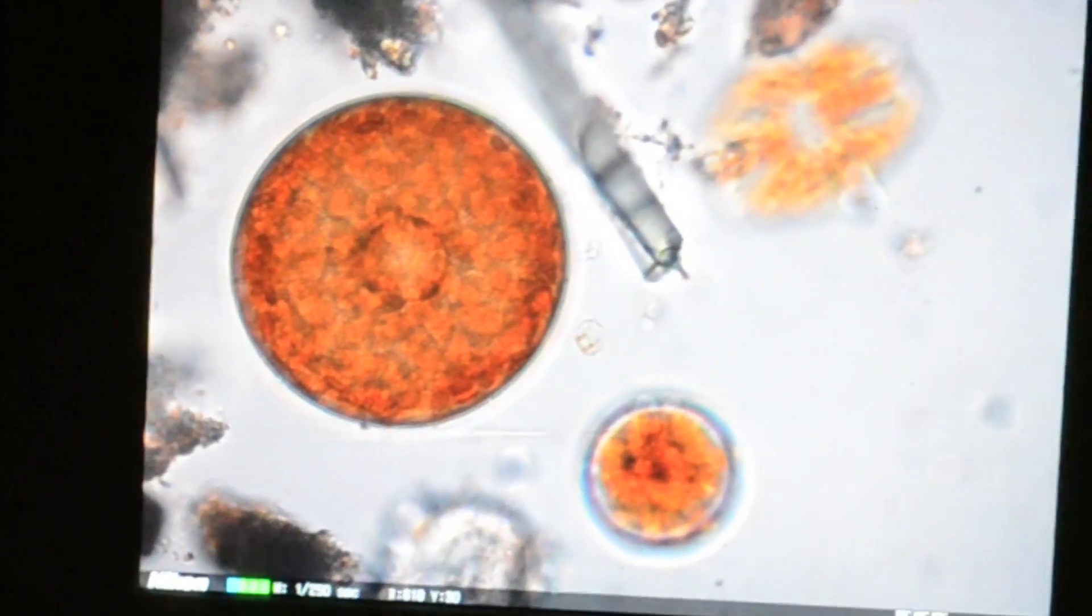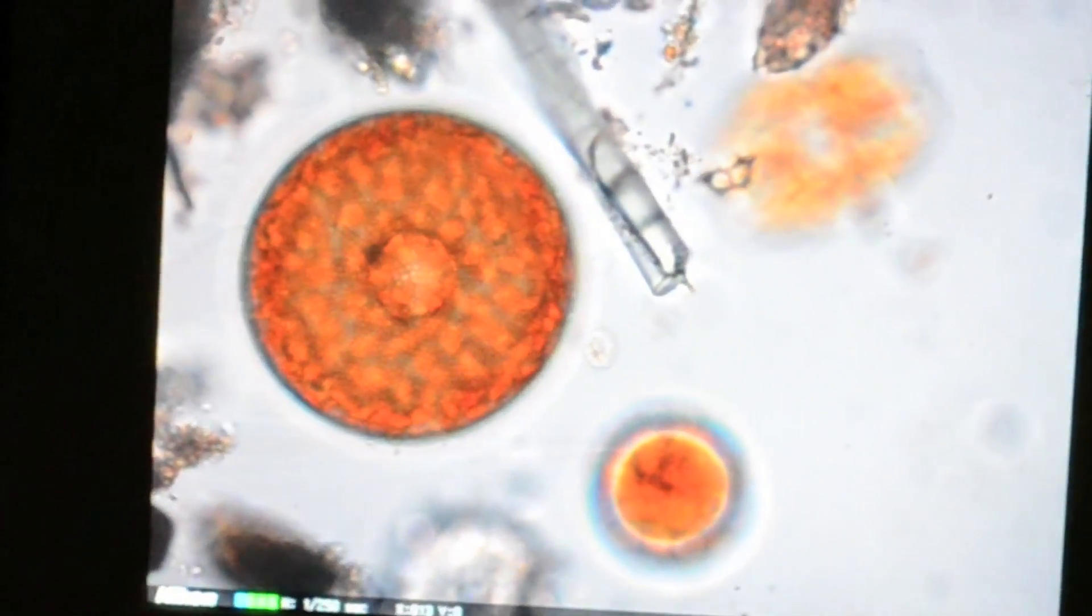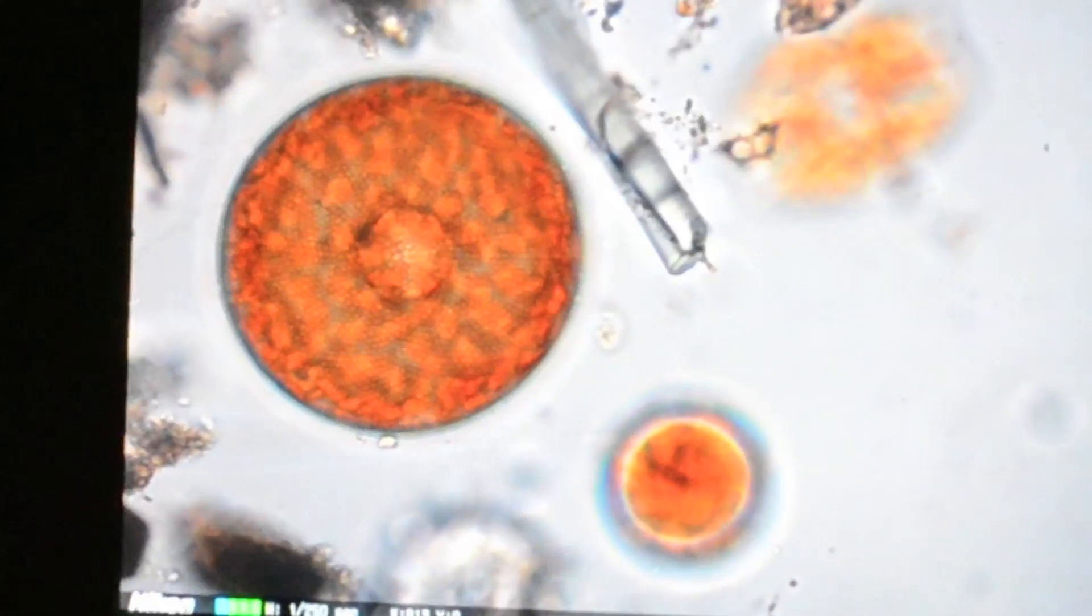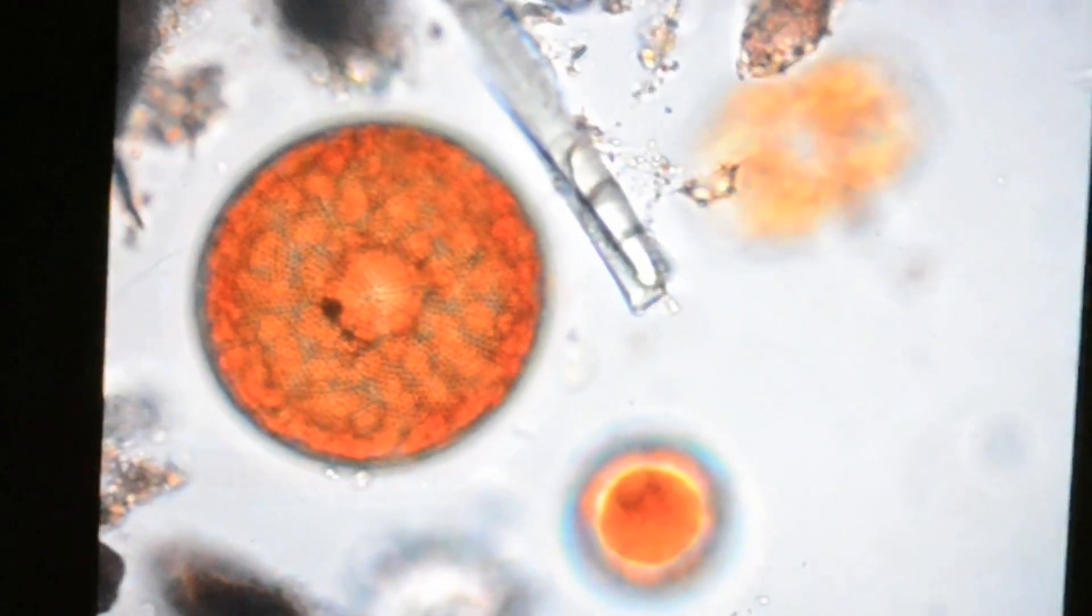You're looking literally at the top lid and all the brown things inside. If I focus up and down, you can see the pattern on the valve and the little brown discs. Those brown discs are actually the chloroplasts. They look brown instead of green because even though they have chlorophyll, they have a lot of other pigments that mask the green of the chlorophyll.